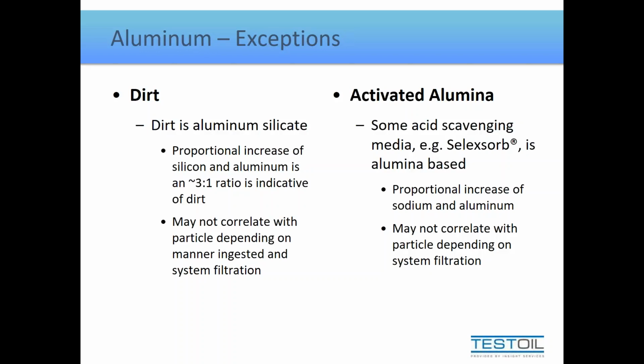It is a sodium and aluminum based product. It will escape its filter housing to some degree, and that powder that escapes will produce some level of sodium and aluminum in the oil. Now, generally, it's not very harmful in the short term. In the long term, it can help to produce some metal salts within the system, which is not good. But if you've got decent particulate filtration on the oil, you'll probably strip most of it back out. It just takes time.